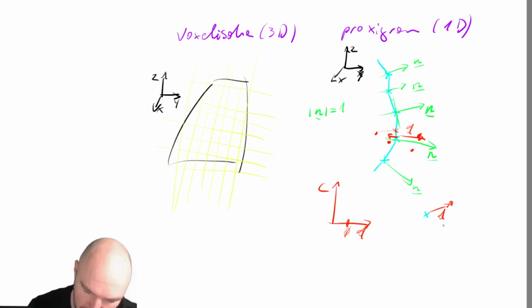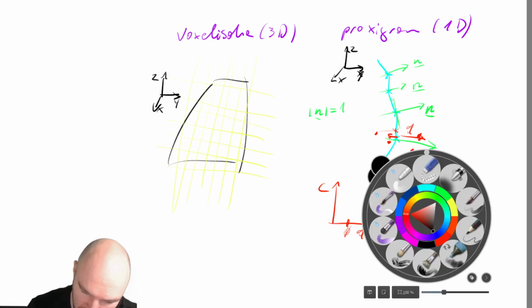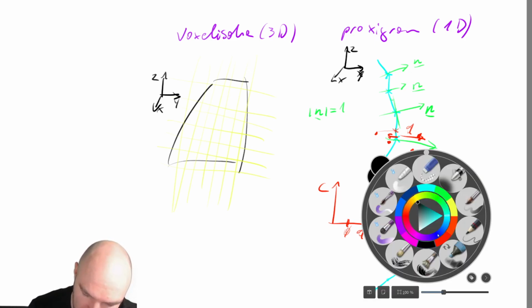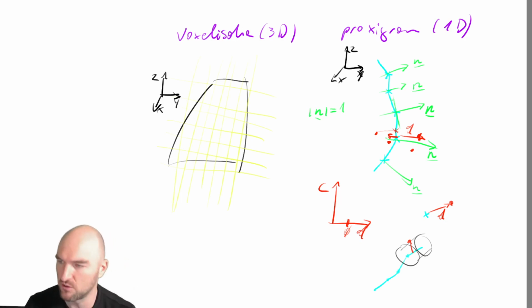Distance d to that point object. Or if you have some kind of line object in 3D, then that distance would essentially be the distance to the line segment. Probably not the distance to the vertex, but the distance to the line segment. So just imagine you create a cylinder around it, and it would be the radius of whatever cylinder you have, and the distance to the line segment.